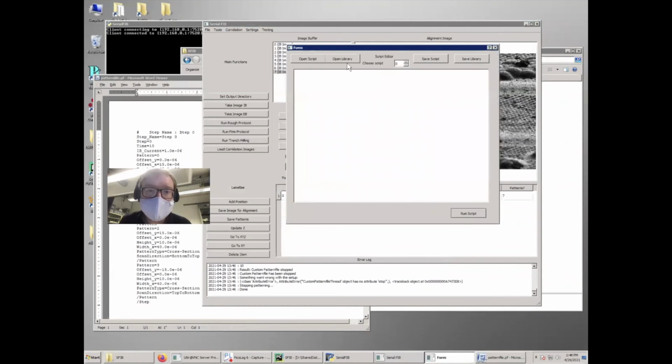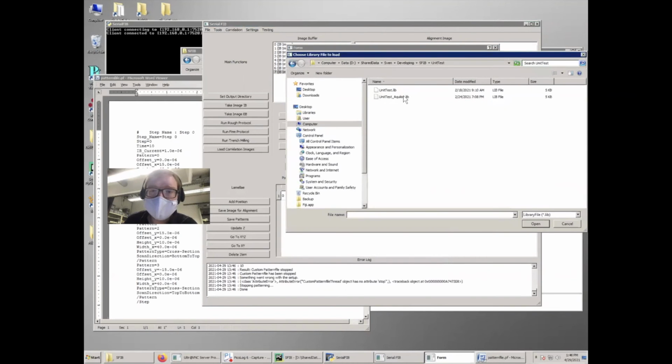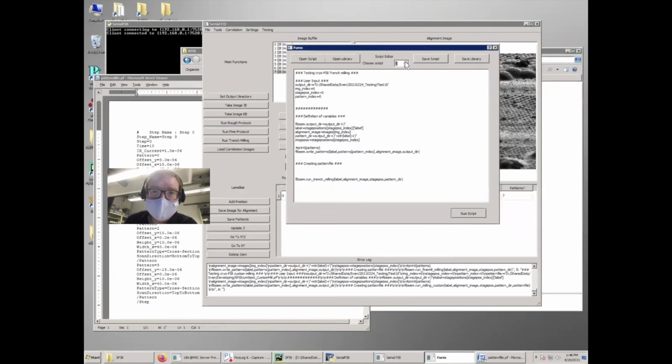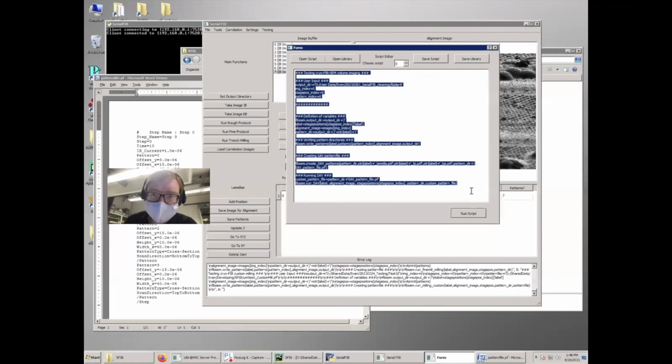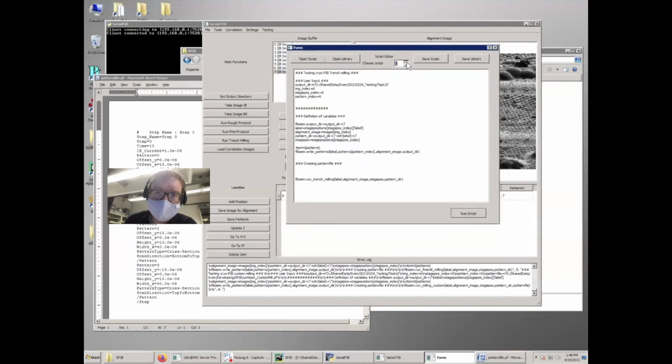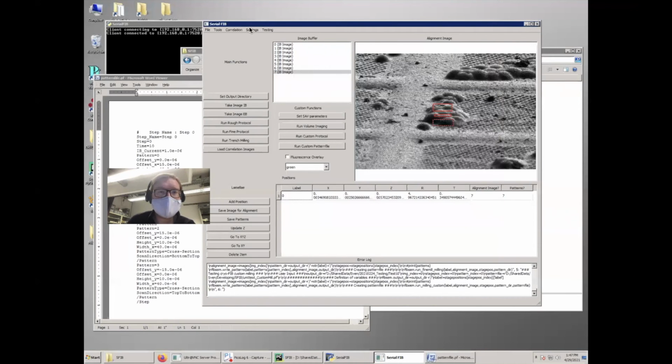which you can just open here. And there's open script and open library. So this is kind of associated again with the numbering in the library. So you could also distribute these scripts or something. And then the library is simply a certain amount of scripts that you've written. And OpenScript is simply going to put a script to wherever you are at the moment, rather than opening an entire library. Same goes for save functions of that. And with that, I think we are there.